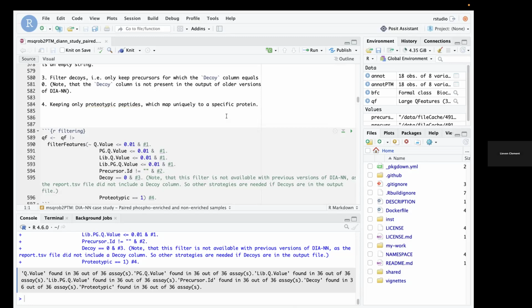That's related to a specific species. What you typically do is that you have your mass spec data, and then you also download from UniProt for your species the whole FASTA file. We will do that also because we will need that later on to make nice plots for proteins. So you basically have a reference protein sequence of all the possible proteins for this particular species, and you use that for the mapping.